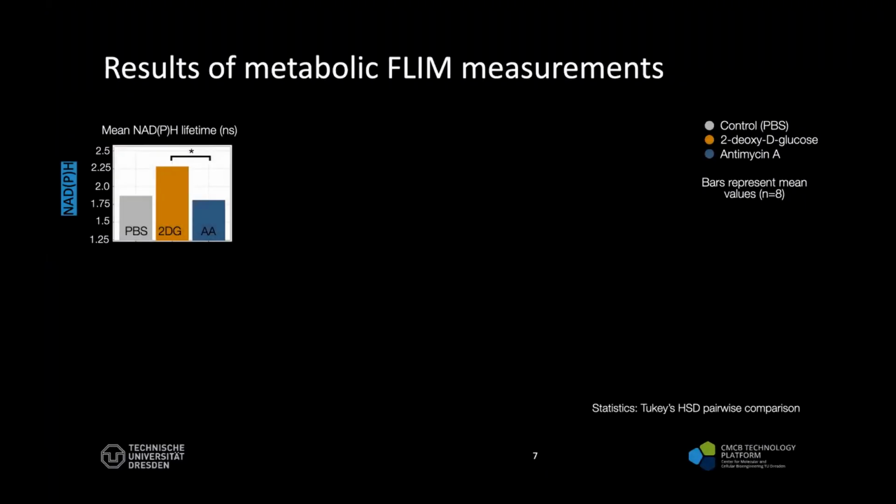Okay, so since we only have a few minutes left, I will keep this relatively short and crunchy. So we ran with exactly the measurements that Ali had presented. We used salivary glands as presented early, had a control treatment, or we treated with a glycolysis or an oxidative phosphorylation inhibitor. And what you see here is summarized measurements of 4 different samples each in duplicates, so in 2 different fields of view on the sample.